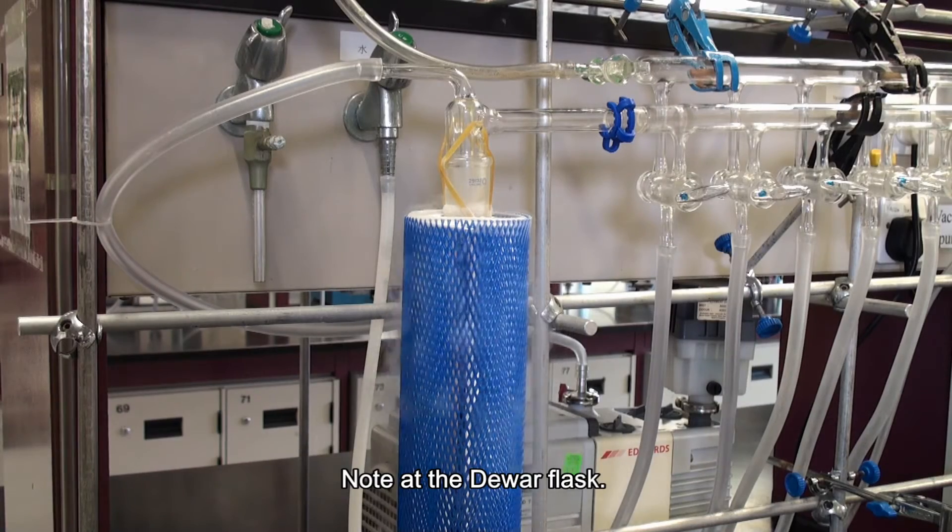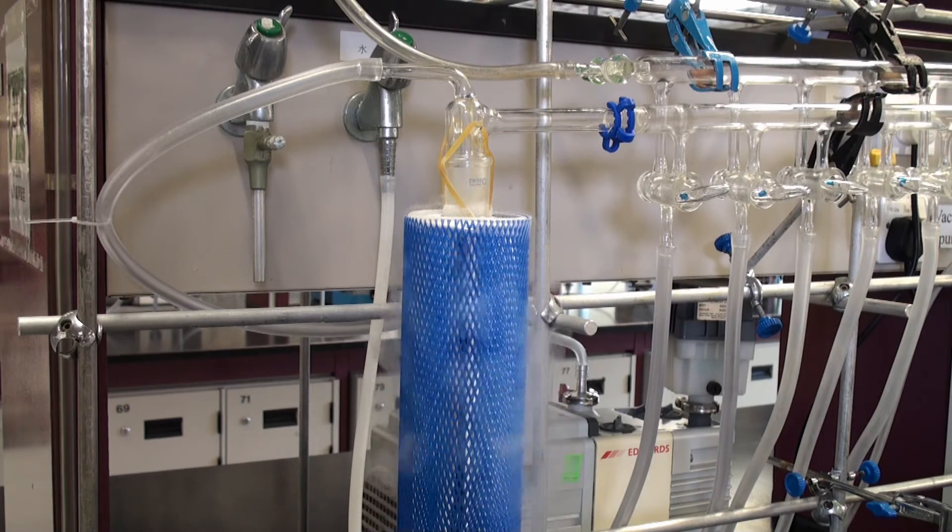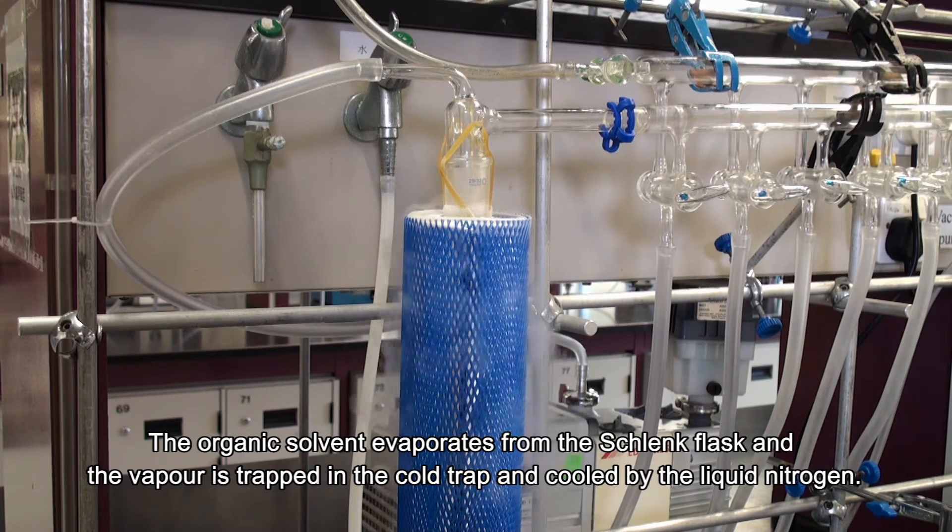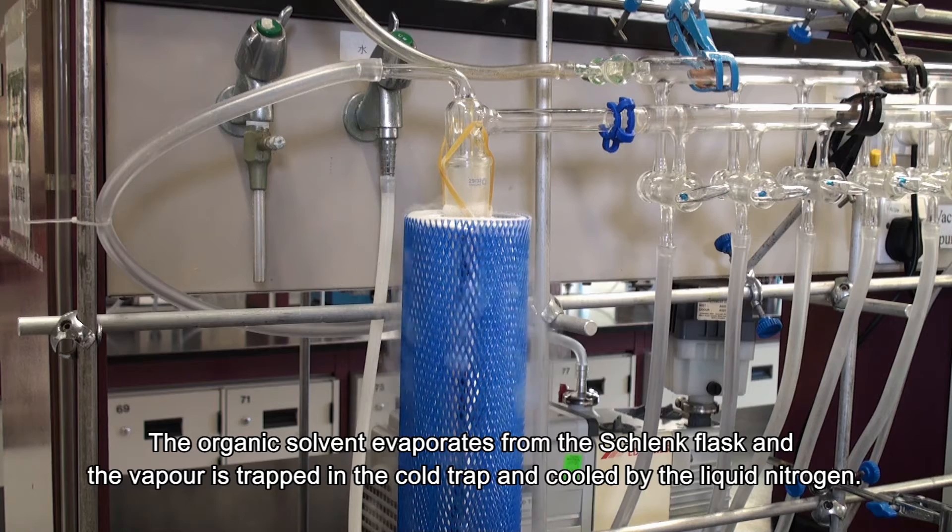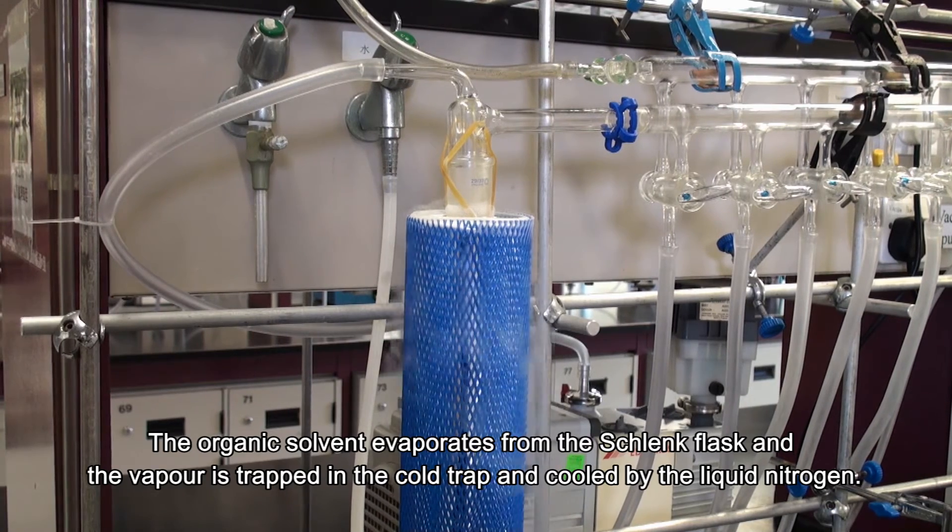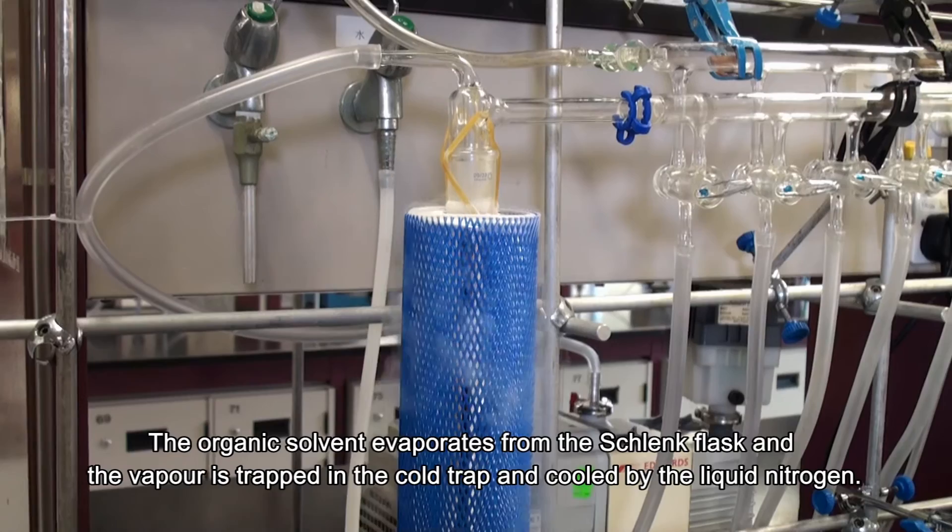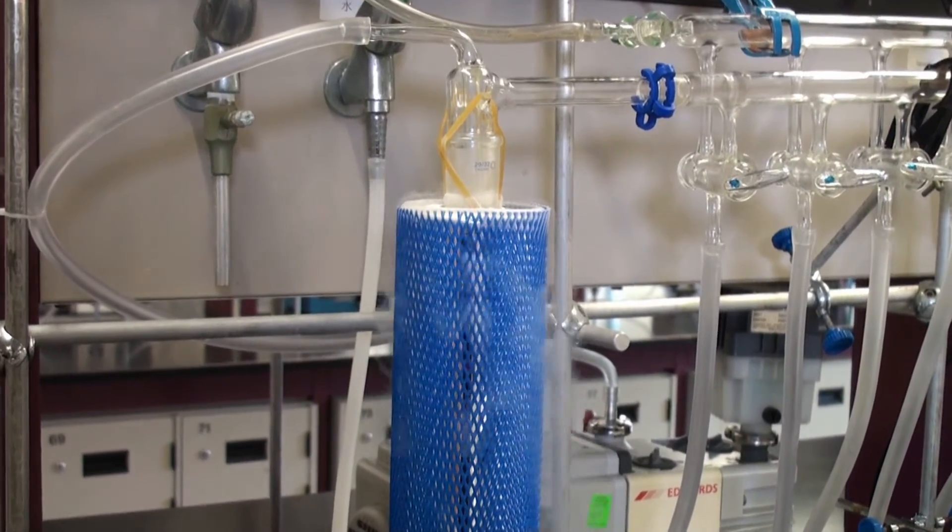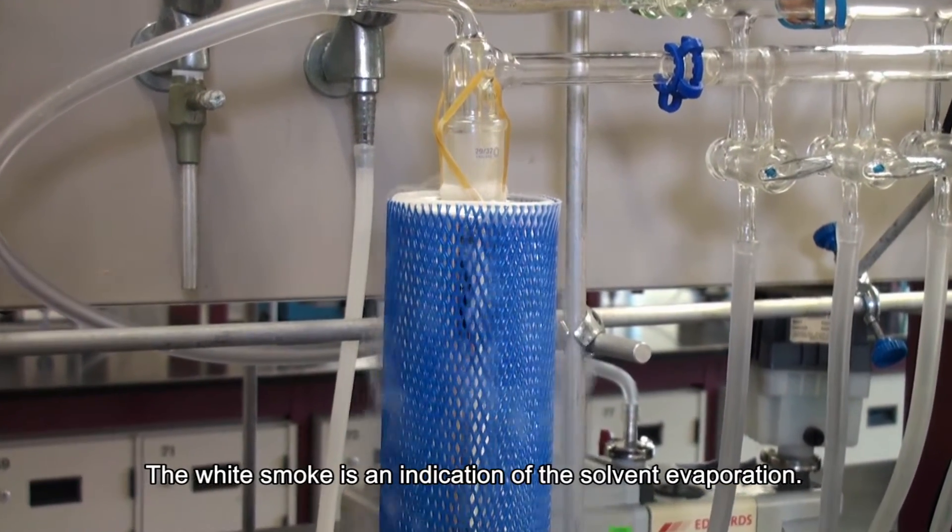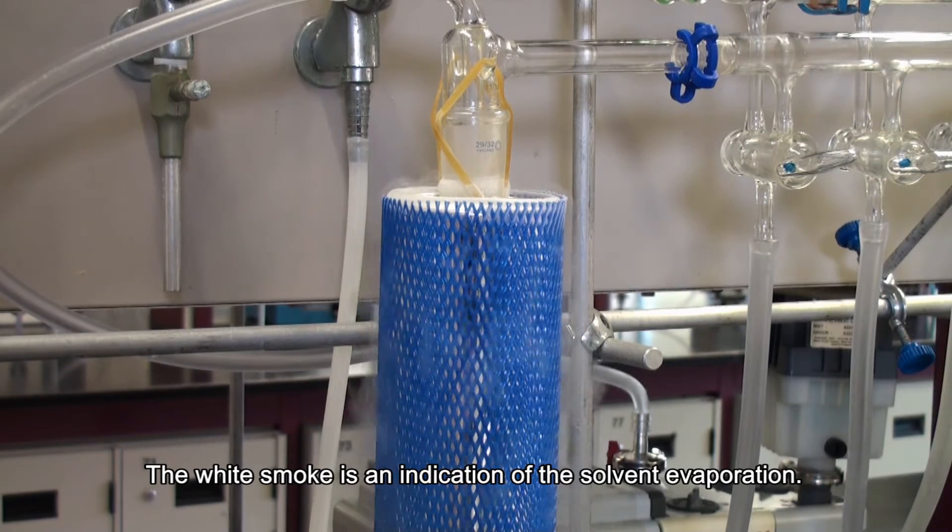Note the Dewar flask. The organic solvent evaporates from the Schlenk flask and the vapor is trapped in the cold trap and cooled by the liquid nitrogen. The white smoke is an indication of the solvent evaporation.